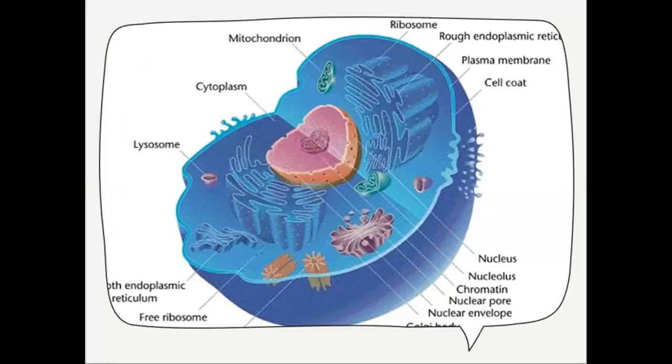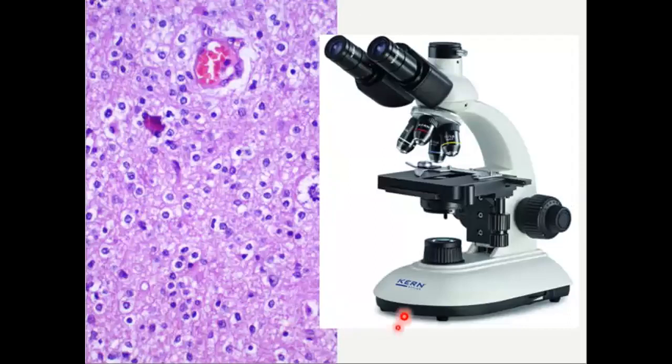However, not all these structures can be seen with the light microscope. So this is a light microscope, which is easily available in a laboratory. And this is the common appearance that you will come across with the histological slides. Without a basic understanding, this will be just an art with pink and purple dots for you. And let's try to move a step ahead through this small guide.